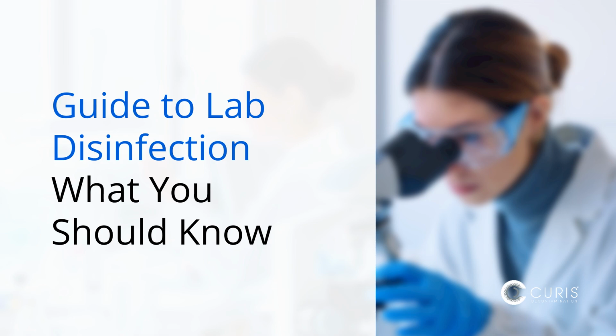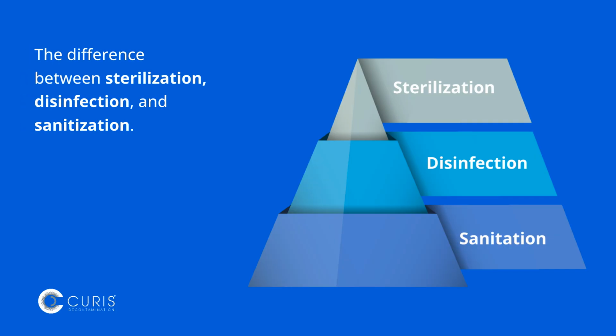In laboratory environments, contamination control isn't optional, it's foundational. But one of the most common gaps in lab safety starts with something surprisingly simple: confusing the difference between sterilization, disinfection, and sanitization. These terms aren't interchangeable. They represent three distinct levels of microbial control, and knowing when to use each one can directly impact safety, compliance, and research integrity.